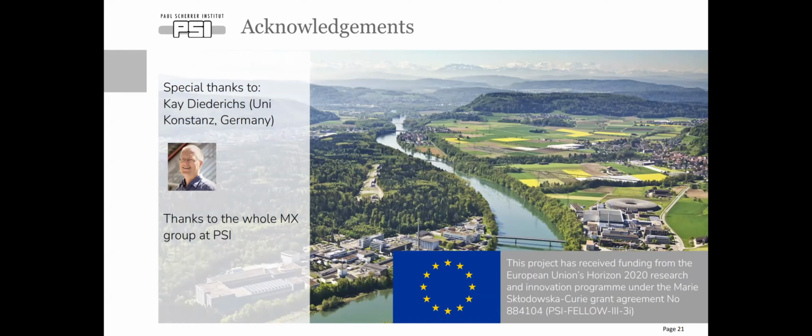As Graeme already said before, you would probably use different parameters for the different data sets, one data set but with different parameters, different geometries or different data range. Your question was which statistics to look at.